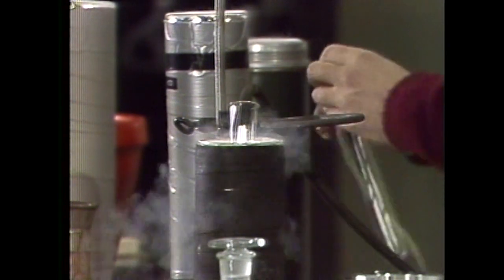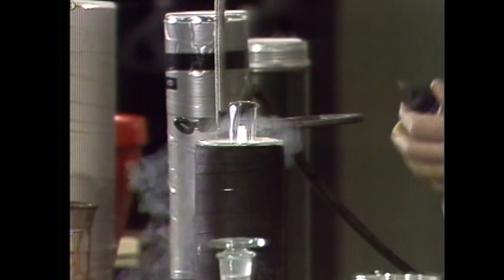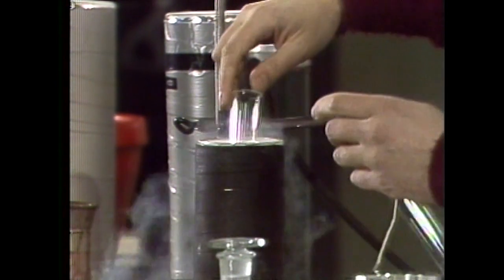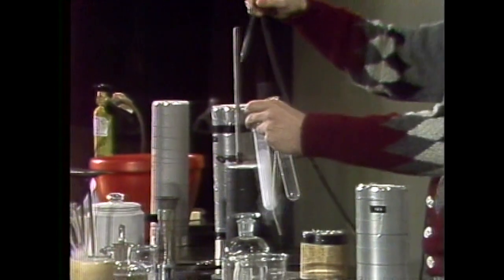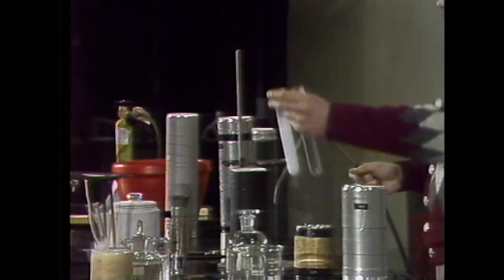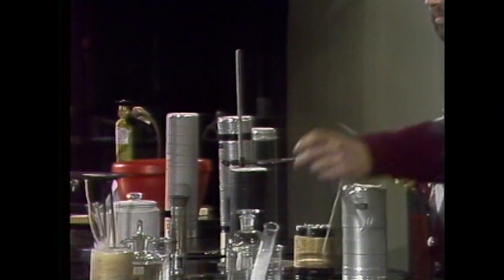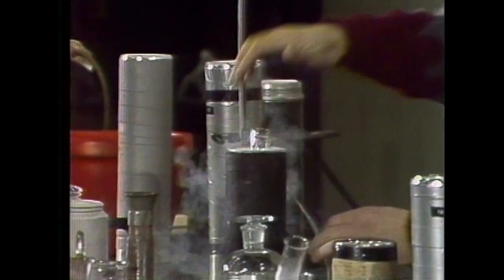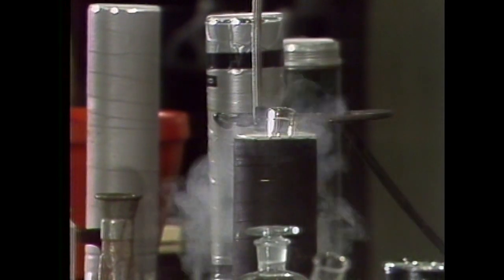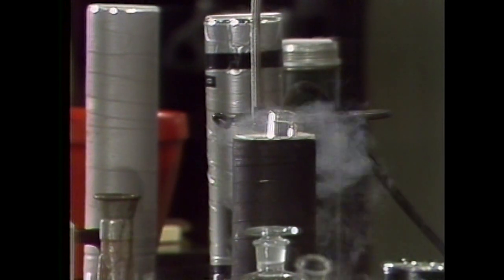And as we're doing that, actually what I really want to do, in order to be able to fish it out, you see some gas is already condensed. You see that? So I'm going to get rid of this. Well, I can get rid of it by just letting it sit here. It'll evaporate. And I'm going to put it in this test tube here because this one has a string on it that I can use to fish it out.